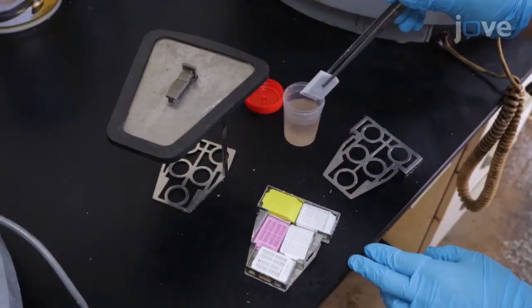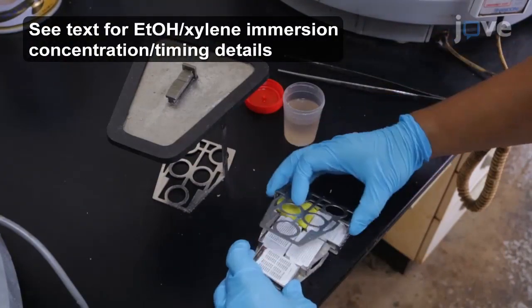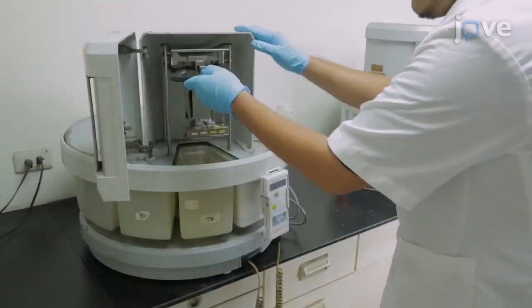Dehydrate the sections in a tissue processor through a series of graded ethanol and xylene immersions, followed by 1-hour and 2-hour paraffin immersions.